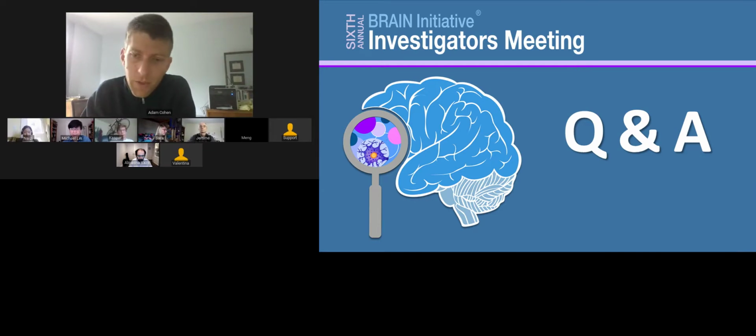Maybe we'll end with a question to all of the speakers. We'll let you speak in whatever order you like. It's about data management. The blessing and the curse of high throughput microscopy is that you have large quantities of data coming in at high speed. Is there any hope for common analysis or handling software, or does everybody have to write their own software? And what are people doing about that challenge?